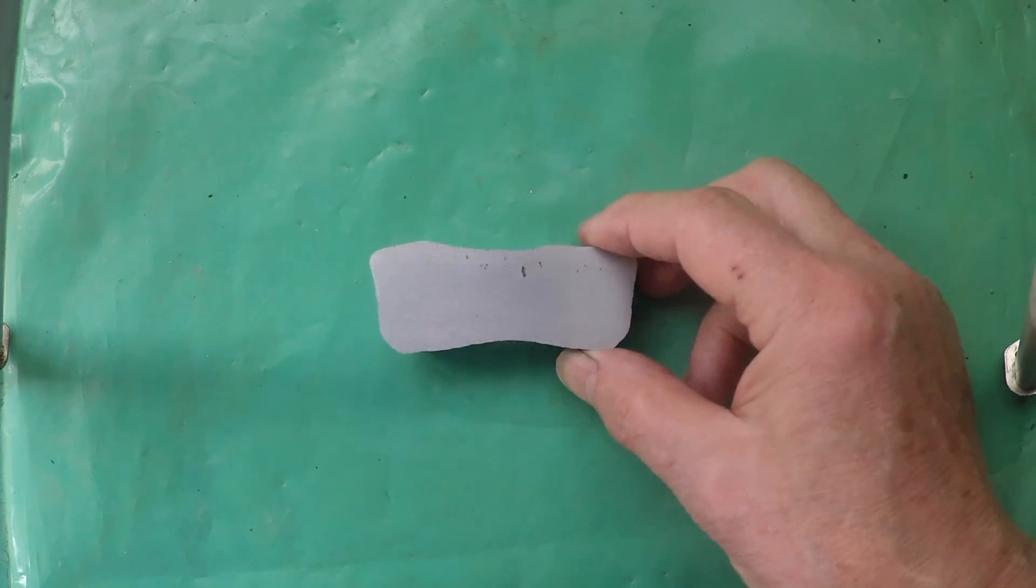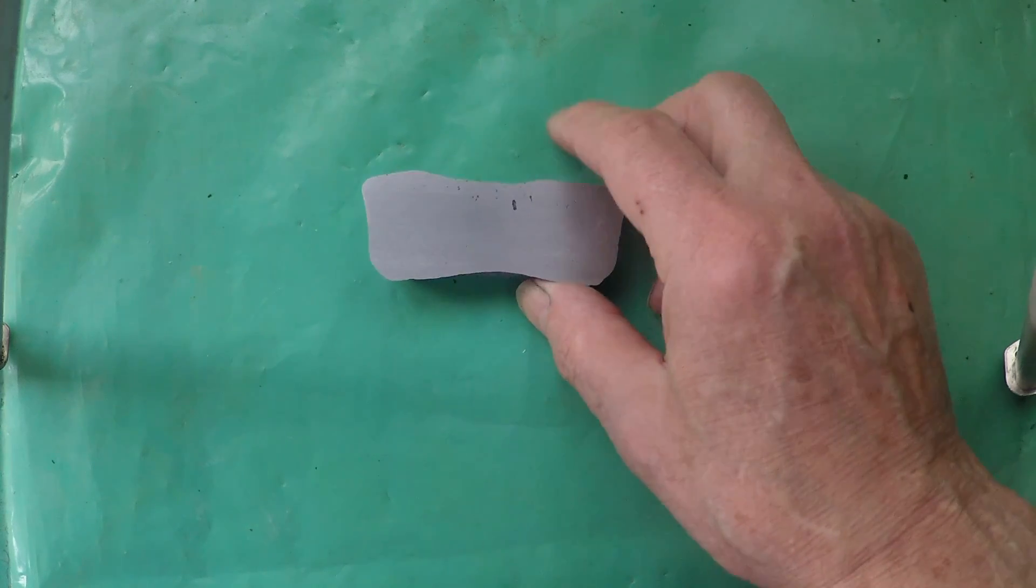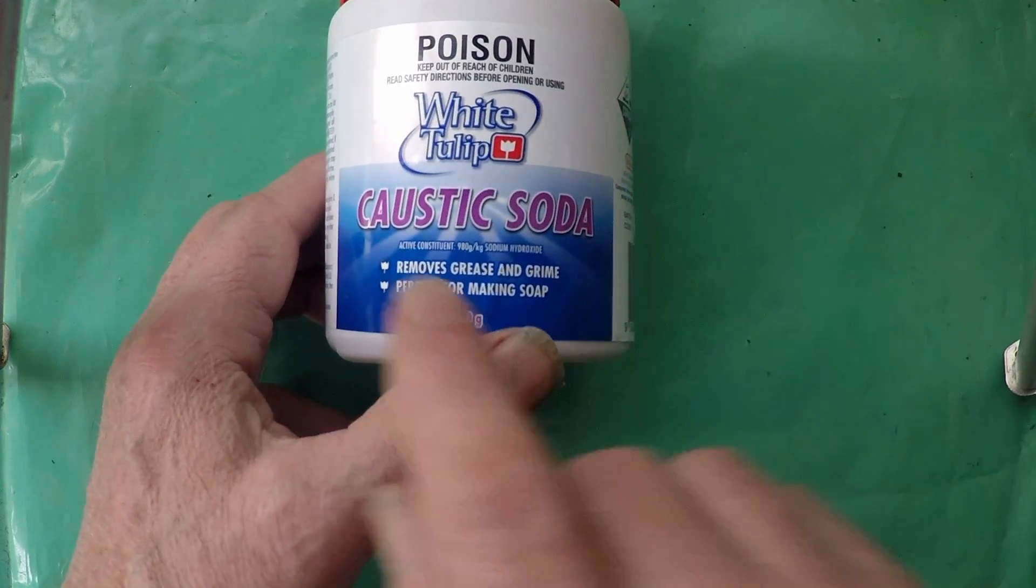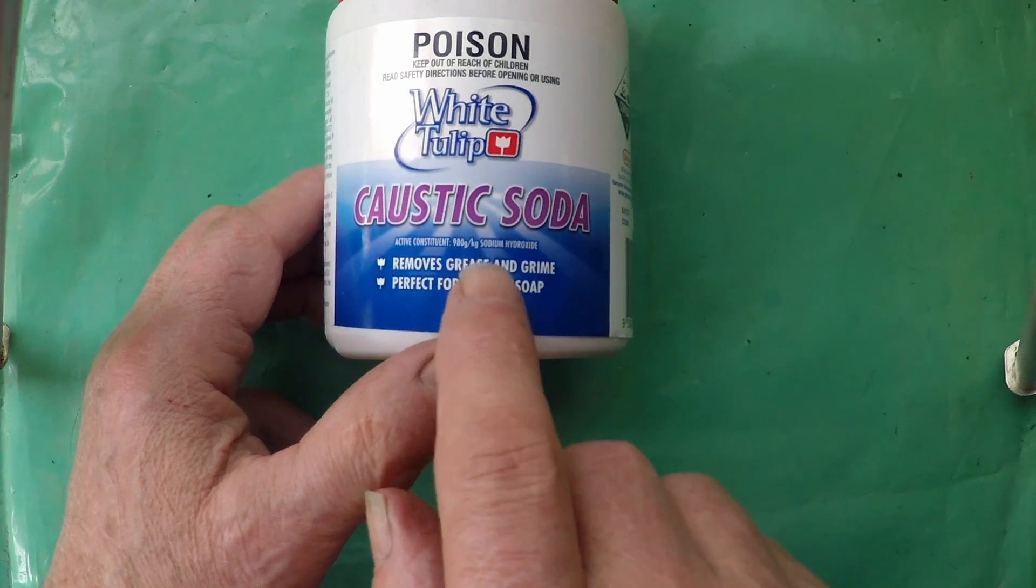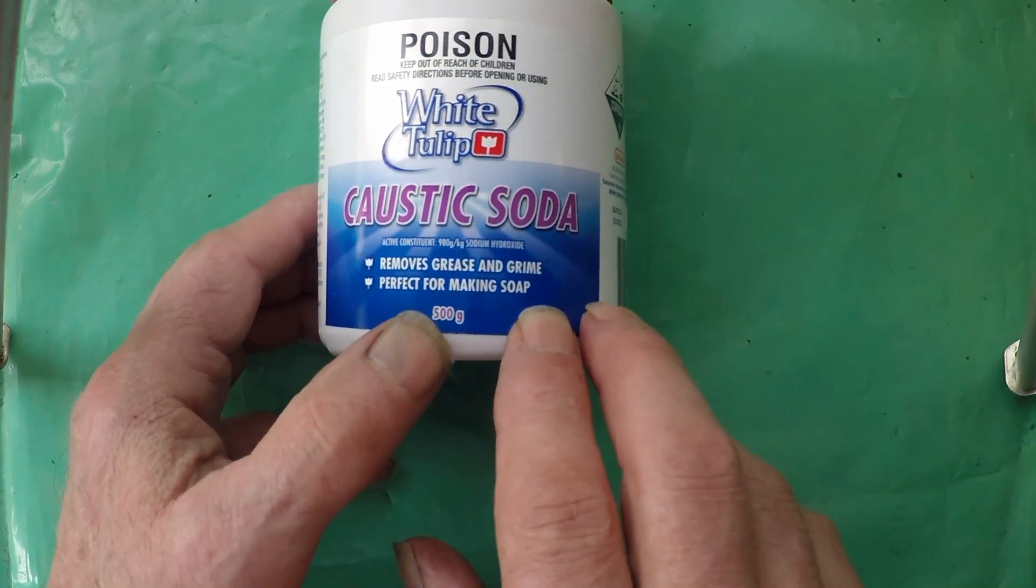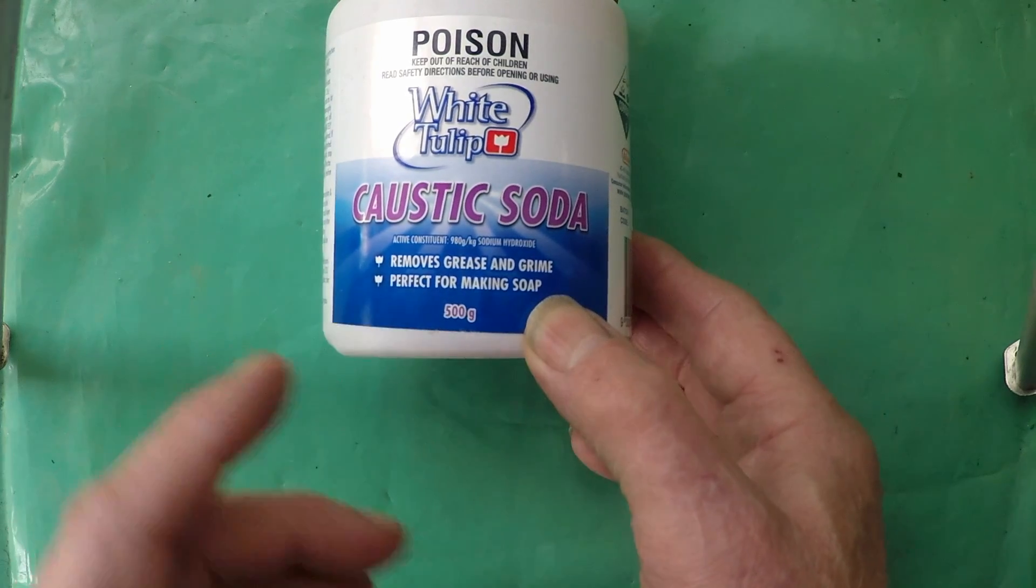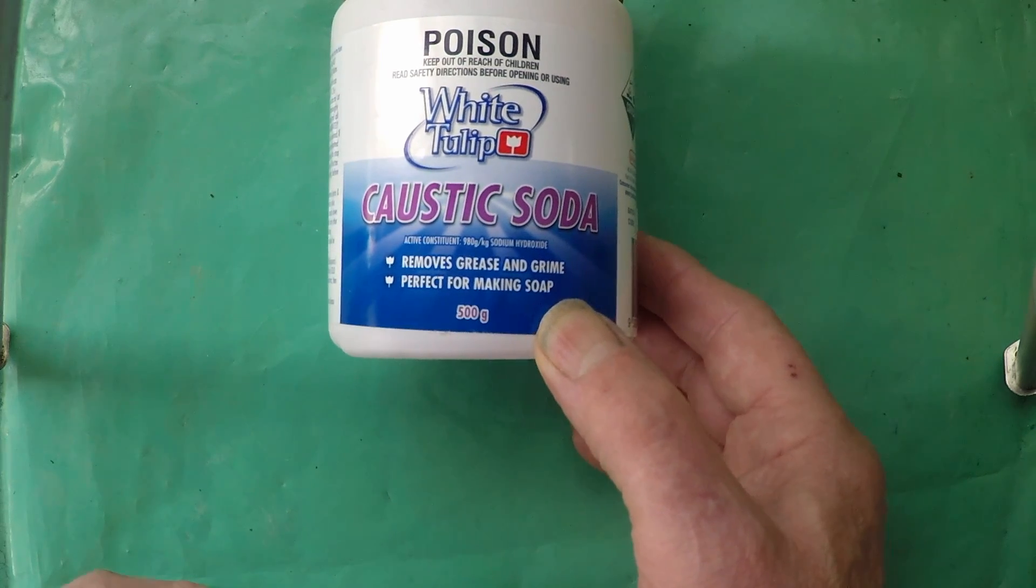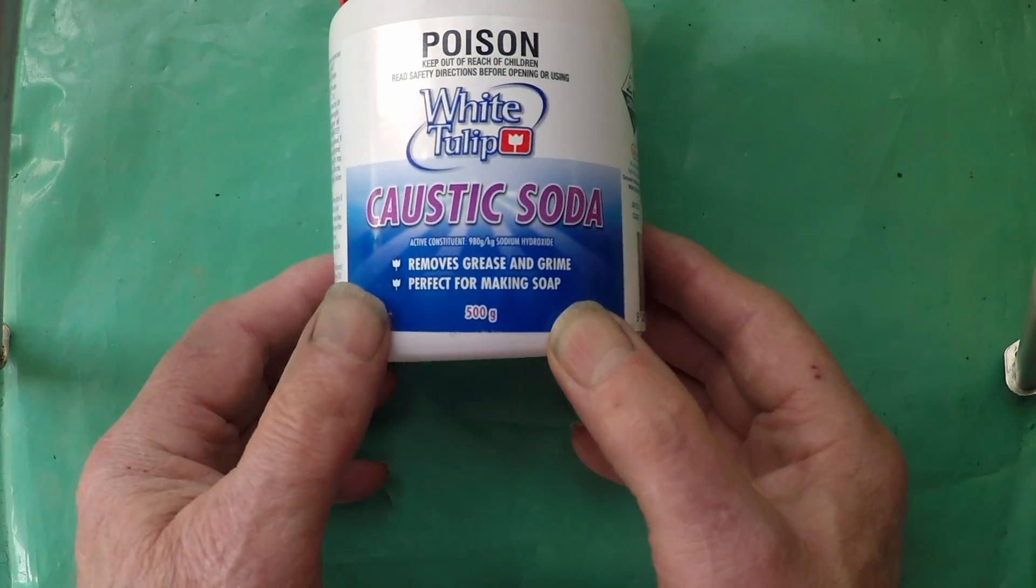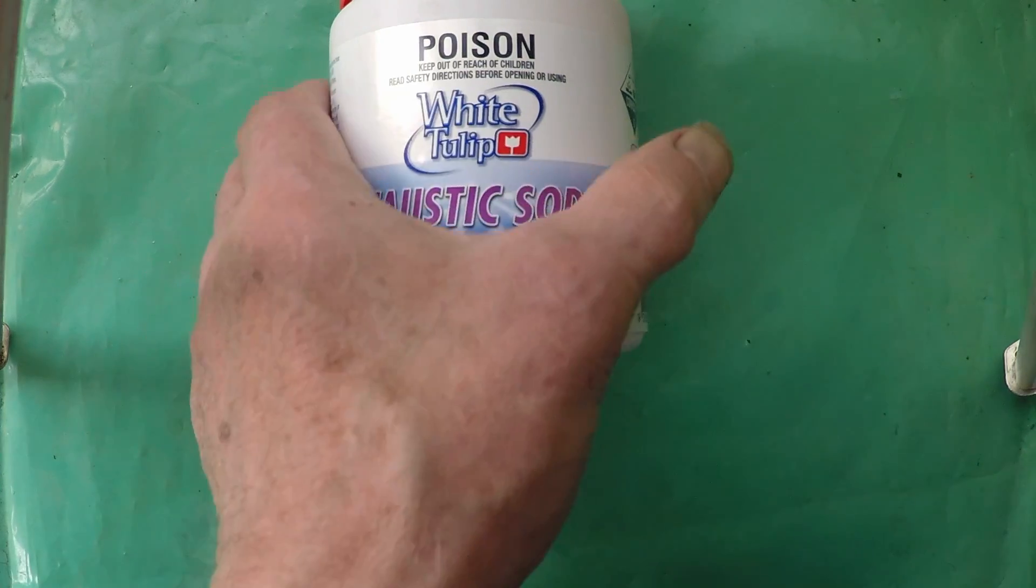Now that we've got our little slice sanded either side it's time to do a bit of caustic etching on it. Now first of all this is what I'm going to use a solution of caustic soda, active constituent 980 grams per kilogram of sodium hydroxide at 98 percent caustic soda. If you can't get pure caustic soda like this then the average drain cleaner will have a good deal of caustic soda in it, you just need to look at the label to work out how much and adjust things appropriately.